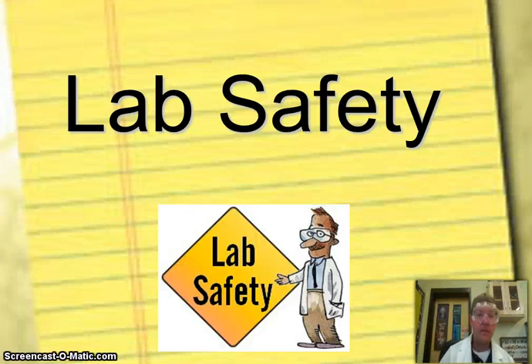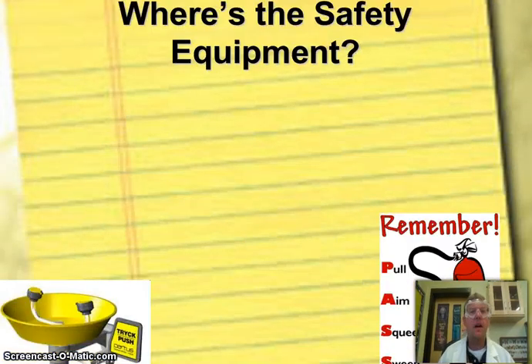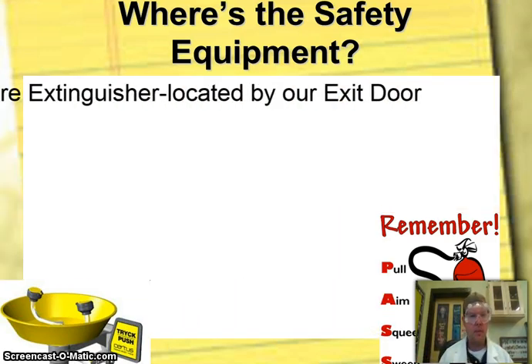Today we're going to talk about lab safety and some of the importance of wearing safety equipment here in the lab. So let's go ahead and get started on our notes here. So where is the safety equipment located in my particular classroom? Well, let's go ahead and talk about that real quick.